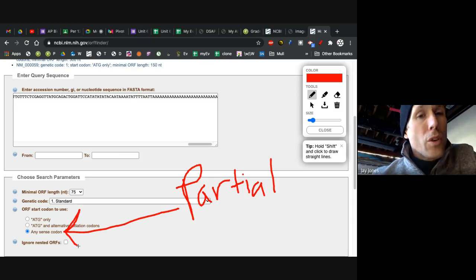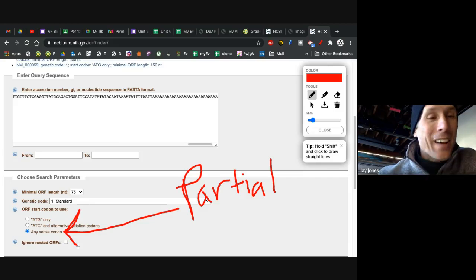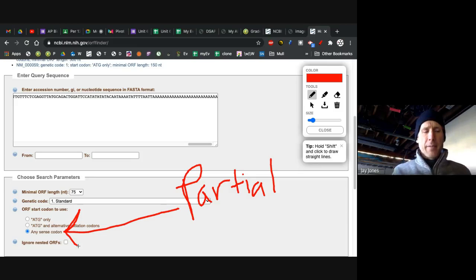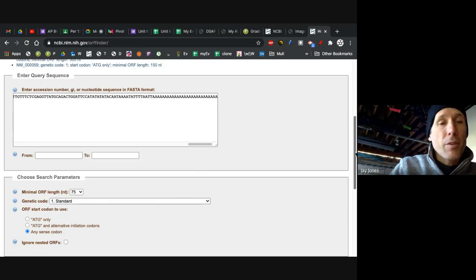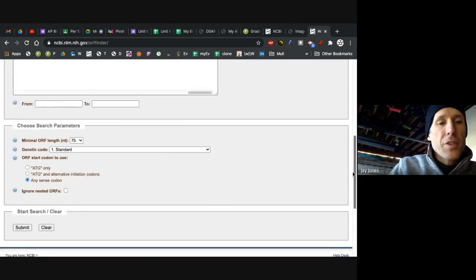For your own clone, which you'll do in the late winter, you don't know what to click. You'll have to try both. But after you BLAST it, you'll have a good idea. And I can help if necessary. That's the beauty of your own clone. It's discovery.